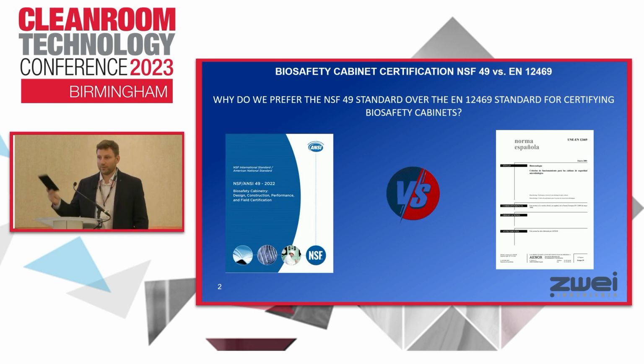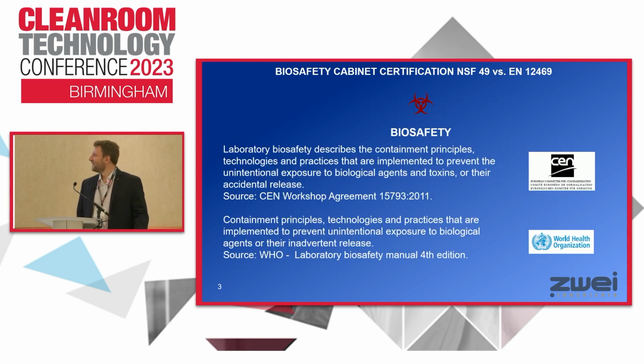I have my helper because English is not my strong suit. All the information in these slides is based on the CEN Workshop Agreement and the Laboratory Biosafety Manual, 4th edition of the World Health Organization, and of course the EN and NSF standards.